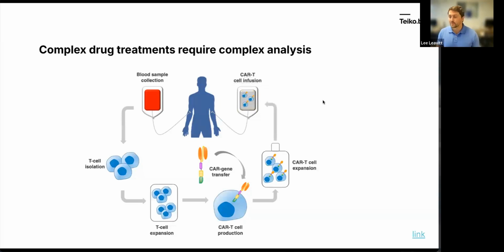Being able to better normalize the data to these lymphodepletion time points increases the signal and reduces the variance of the data. Now you can better identify biological changes that have occurred since the introduction of this therapy. This is one example, but the theme of modern drug development is complex dosing, combination therapies, and biological engineering.